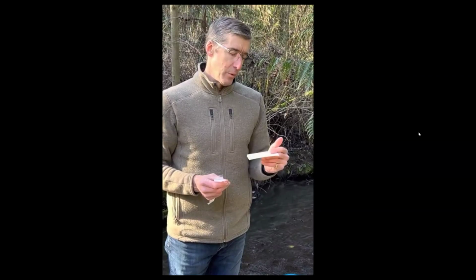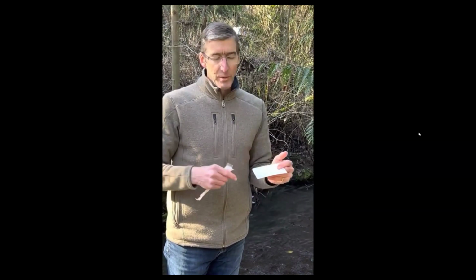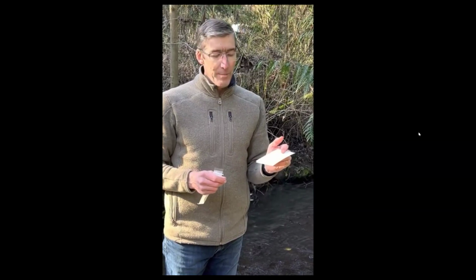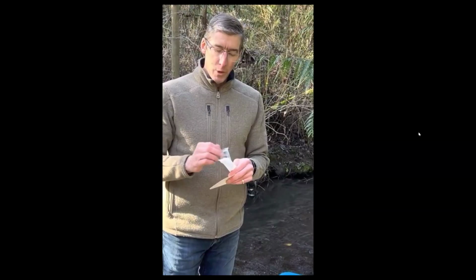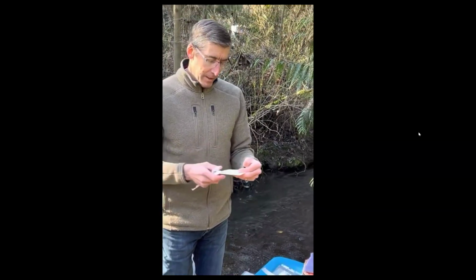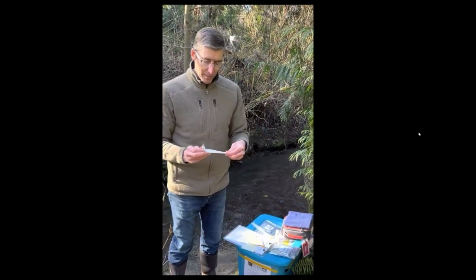So I think for our purposes, if you just have dry, clean hands and you're careful not to stick your fingers right in the principal area of the R card flap, then you won't have a problem. So I've got my pipette opened. I'm gonna get my pipette out, ready to collect my sample.